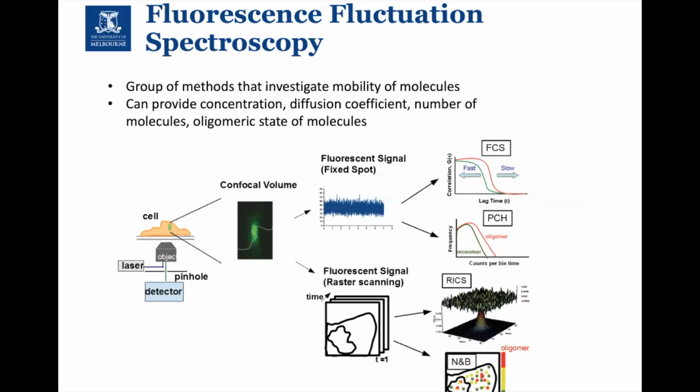The next group of methods are looking at mobility of molecules. So these are highly specialized methods. And there's a number of ways we can approach these. So we have our cell sitting in there live within the confocal.